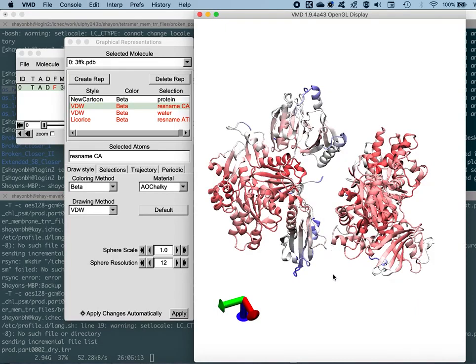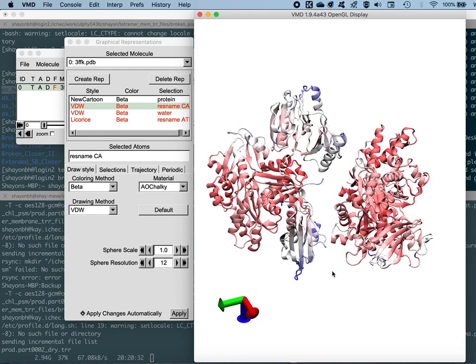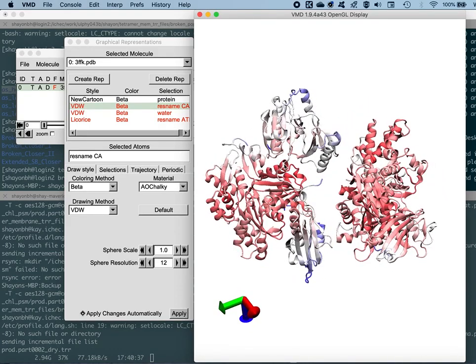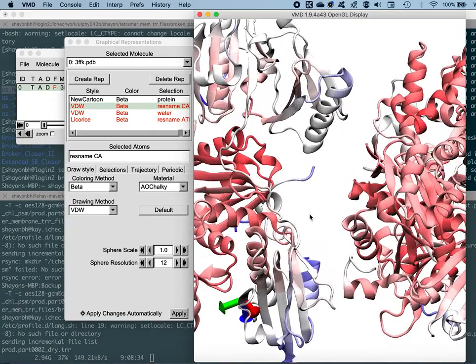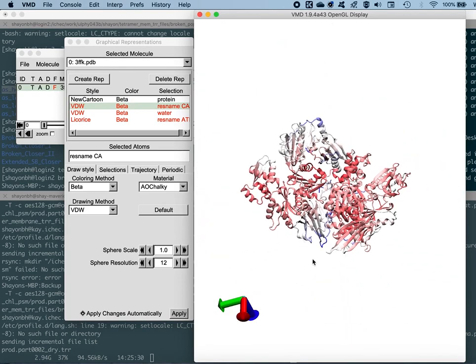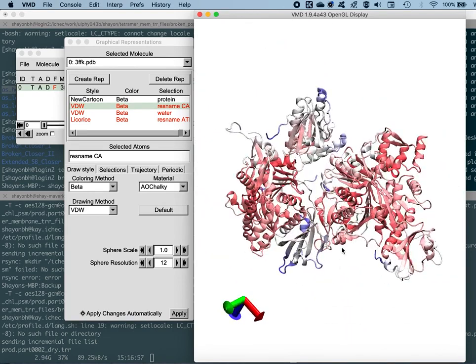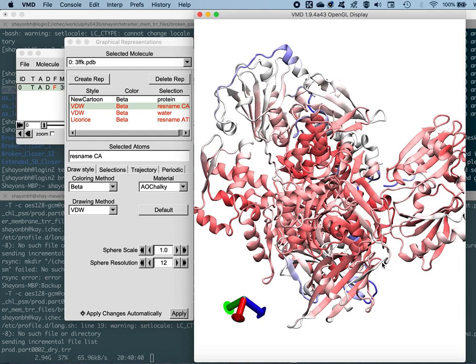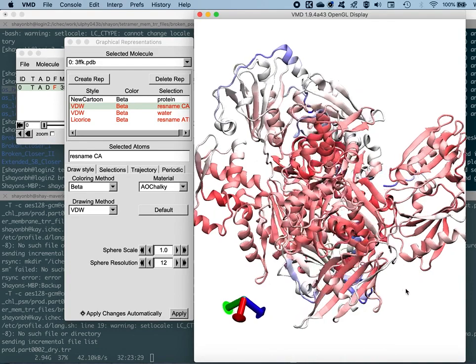the slides, it's mentioned there that the gelsolin and the actin complex can dissociate from each other by binding of a ligand to the gelsolin loop region, which is basically here for this subunit, as you can see, this loop region out here. Just going to bring this more into focus. So this guy. So this is where the ligand lysophosphatidic acid, or LPA, binds to the gelsolin monomer of a single subunit, whereas the same you will find in here. Okay, so this is the loop region where the lysophosphatidic acid ligand binds to this other subunit.